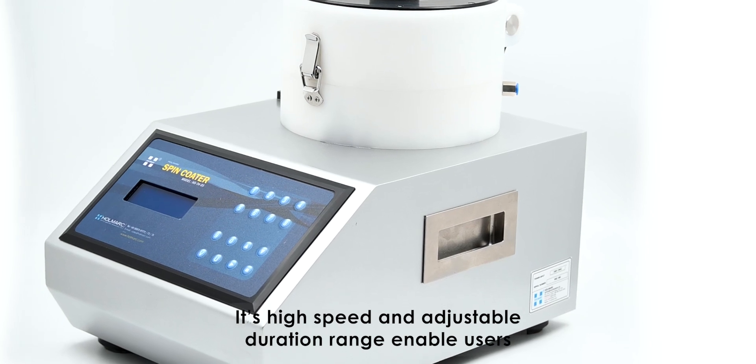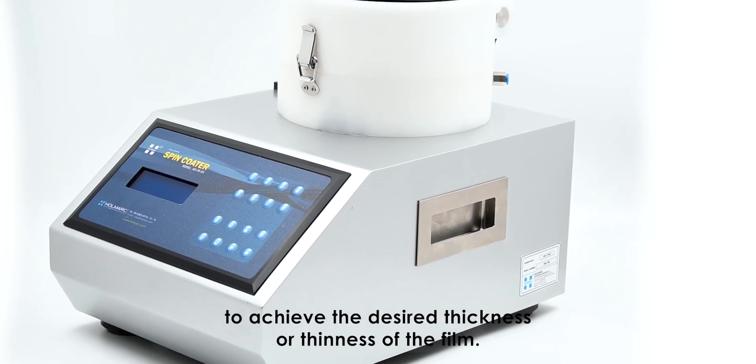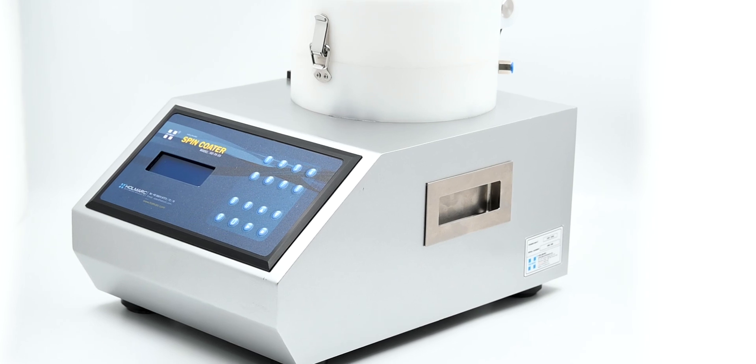Its high speed and adjustable duration range enable users to achieve the desired thickness or thinness of the film.